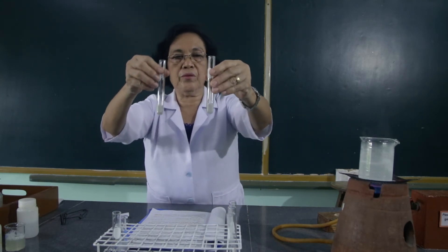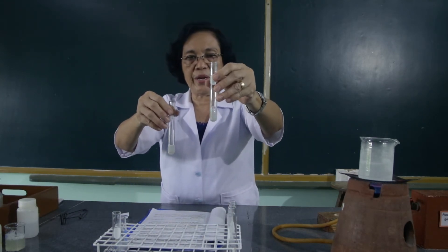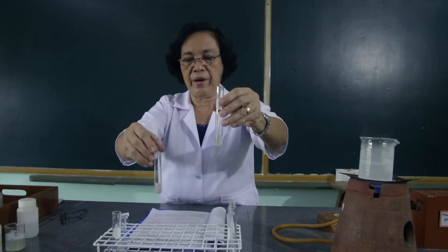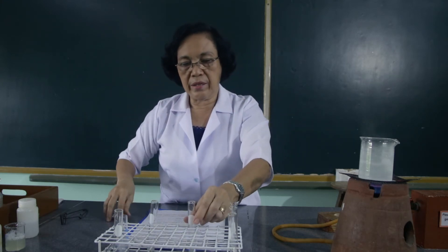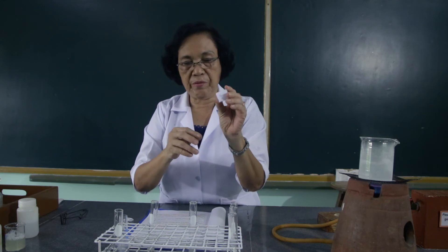For one test tube, we are going to saturate this with sodium chloride. So I have here the sodium chloride.